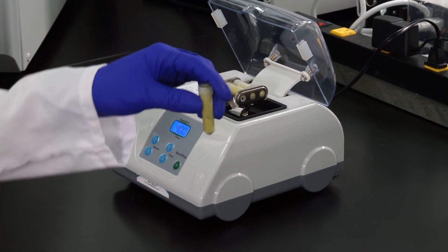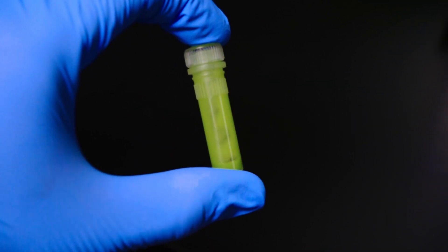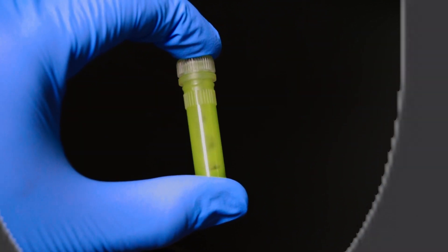For an example of the HT-Mini being used in the field, please watch our rapid field prep video.